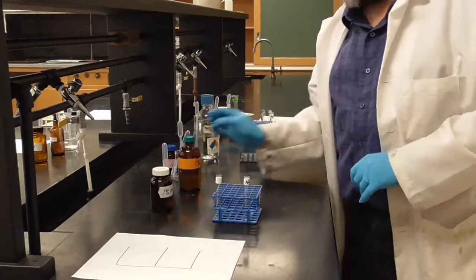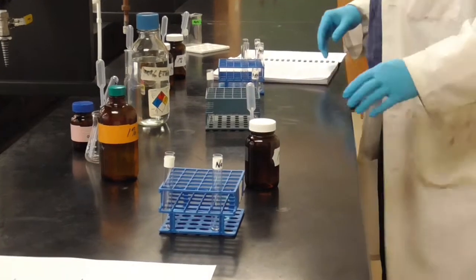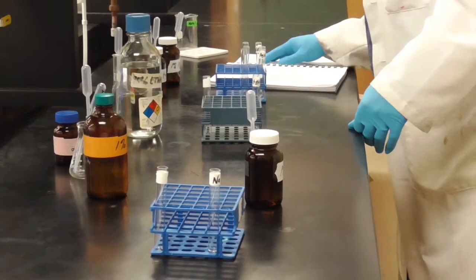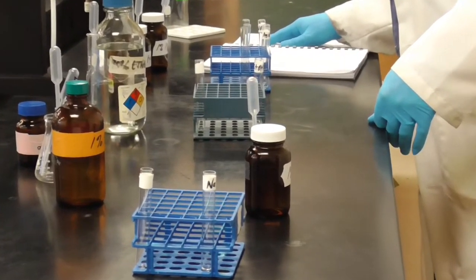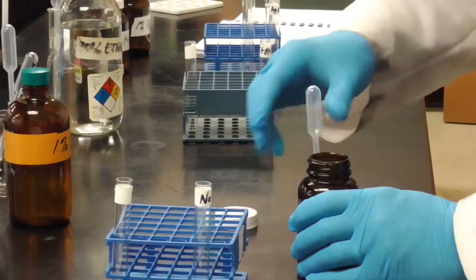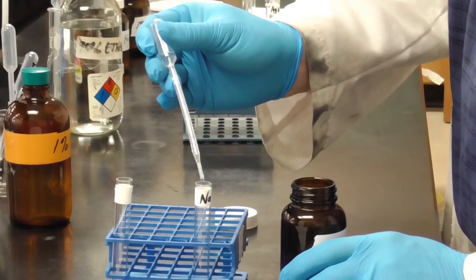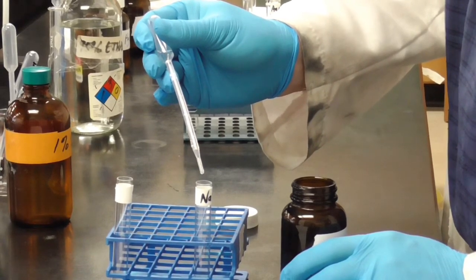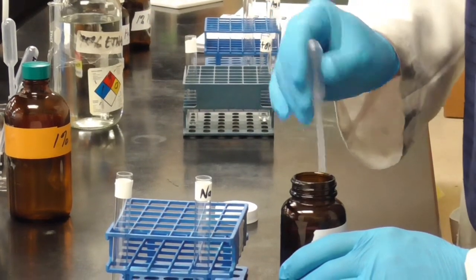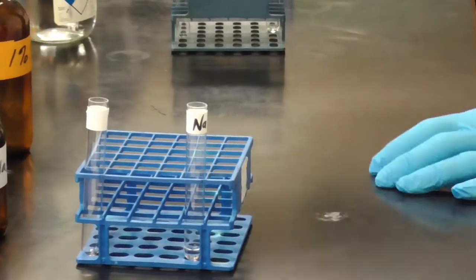And now we're going to add the solution of possible inhibitors. And so, how much do they want us to add here? 10 drops of each one. Just reading ahead. Yep, 10 drops of everything. So, sodium chloride. 2, 3, 4, 5, 6, 7, 8, 9, 10. Ethanol.